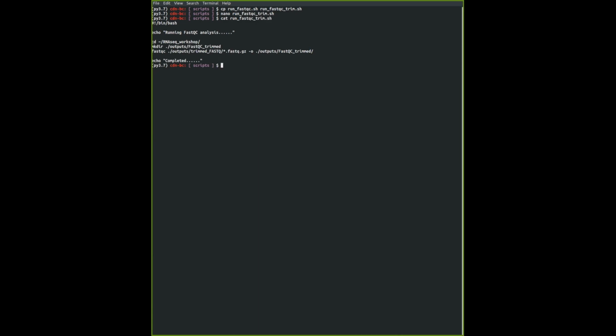You can create your own shell file, that's fine. Make sure that when you run bash, you run the right shell script, all right? And then in Nano, open up this newly created file and make sure that you amend the script as such.